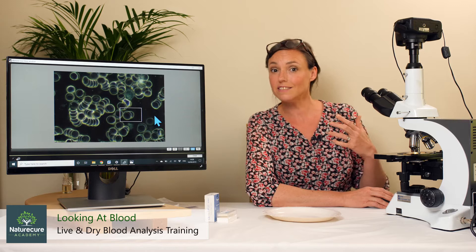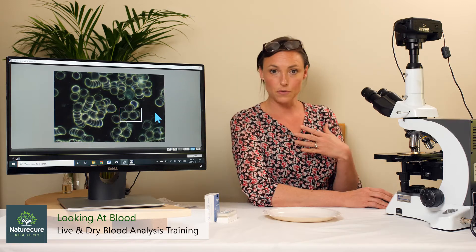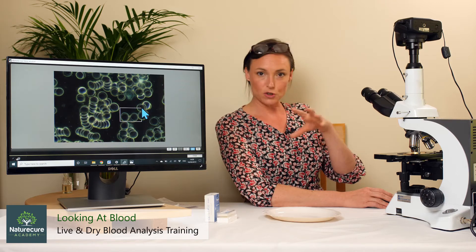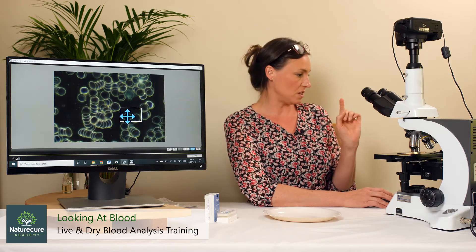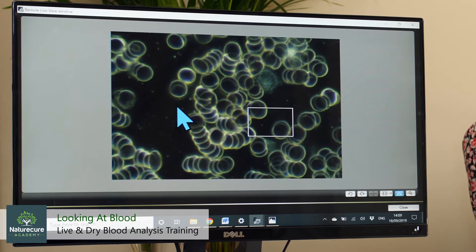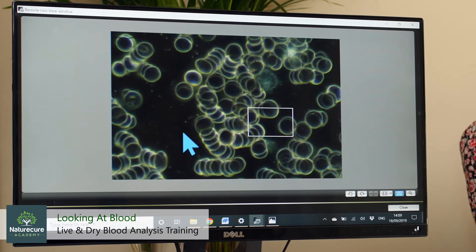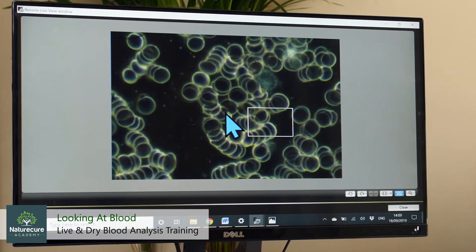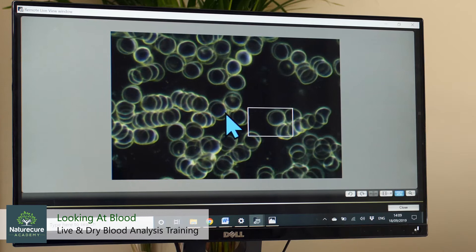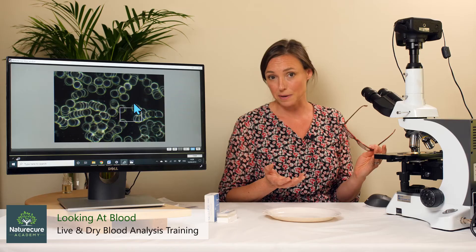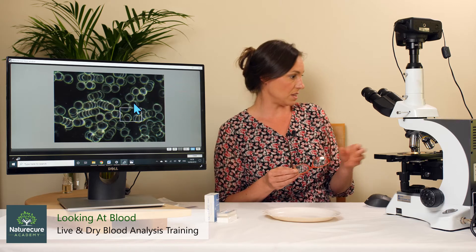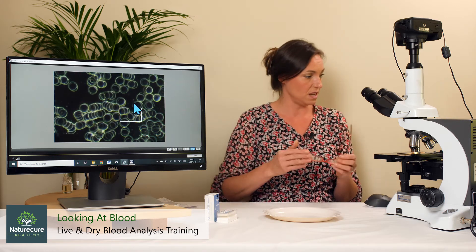What you're seeing here is a blood sample from myself. I ate about five hours ago and I did have a juice, so that might be part of what we're seeing in the blood. We have these round cells here — these are the red blood cells — and we should have millions of those in one drop of blood. The black background that these cells are floating in is the plasma, the blood plasma. You can see that it's a substance the blood cells float around in.